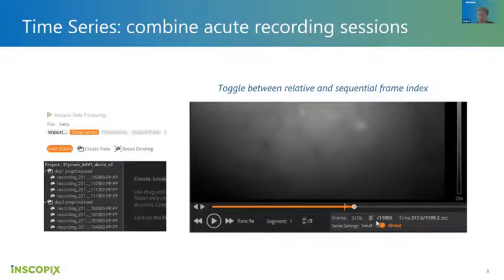Maybe we can import and then create a compatible ISXD file, and later you can do all the analysis you can do with the ISXD format. Yeah, of course, that's something we could do with the API. But I agree that's not the priority for now for IDPS. I think that's probably a feature request. If a lot of people have issues with TIFF files, we can consider offering some API workaround just for them, so they can take advantage of IDPS or the API.